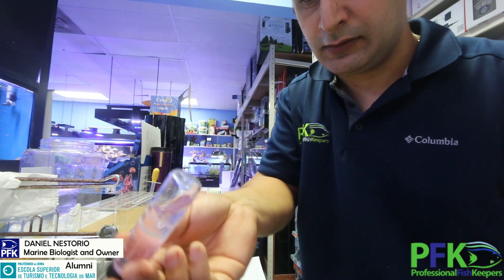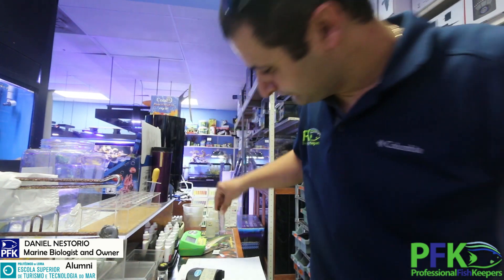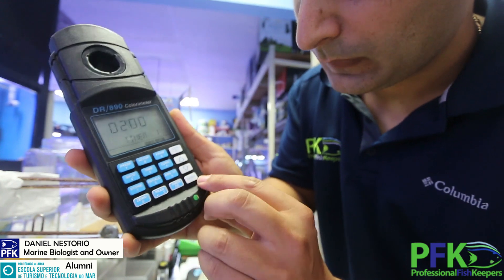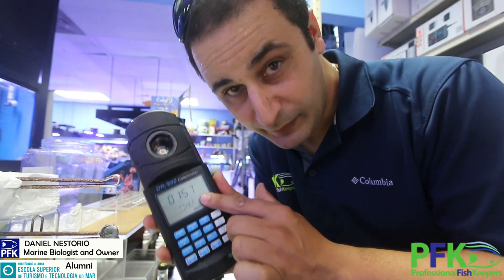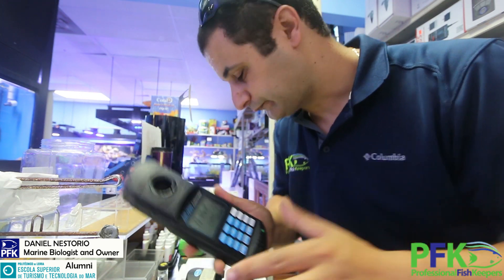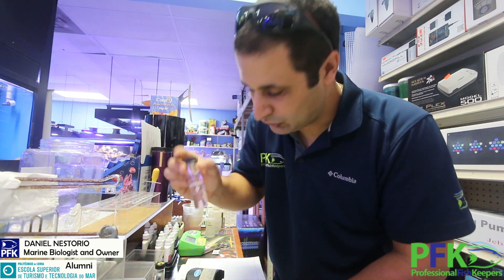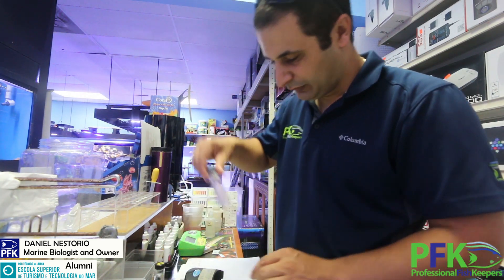You want to shake it slowly like this. Meanwhile, press the timer and then enter — there's a two-minute wait. When the two minutes are done it will beep, and then you zero it and read. But keep shaking it gently while you wait.